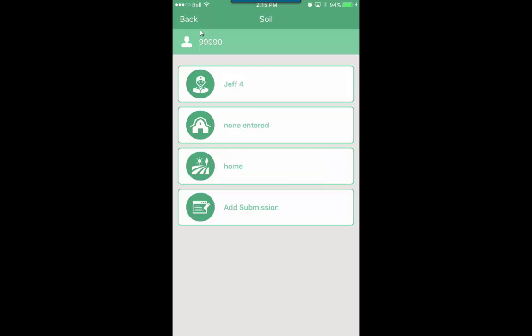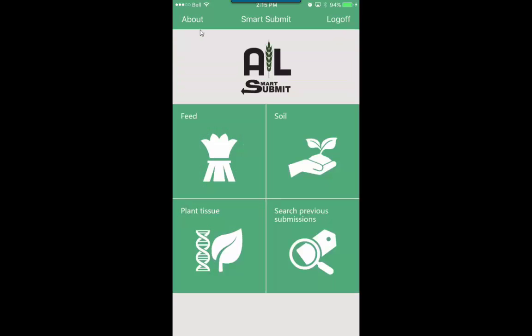Now you're brought back here where you can create another submission for the same grower in the same field, or if you want to start over with a different grower you go back to this screen and start all over again. And so basically that's how we do the soil submission and we'll talk about the other modules in a later time here.